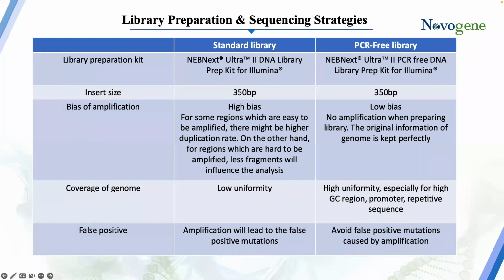As Charles mentioned earlier, when you're working with microbes and small genomes, SNPs could possibly be introduced by the polymerase during this PCR amplification. It could give you artificial SNPs that might be consequential to your research, right? So with a smaller genome, SNPs are more likely to be significant. And so many researchers working with microbes prefer to use a PCR-free library for that reason. We have no chance of adding artificial SNPs.